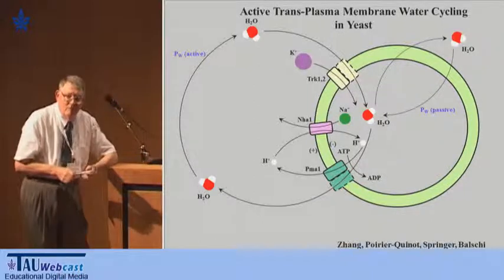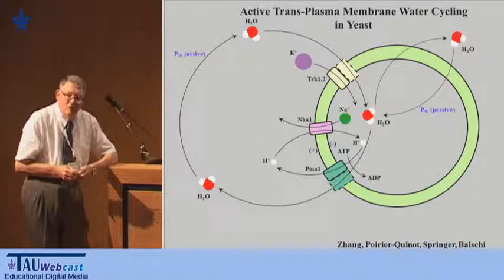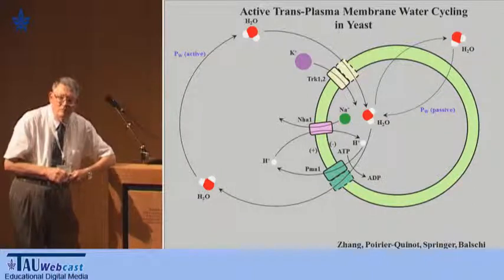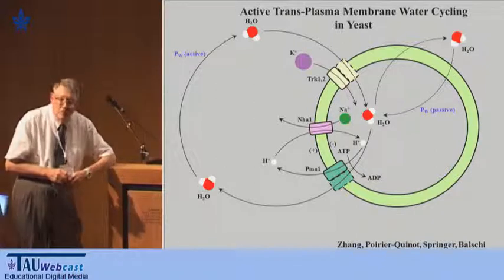Just a follow-up question. So in principle, of course, there are not enough protons, and then the net flux of the ions, the rate at which they go, can be relatively slow. But you could have an exchange that is going back and forth relatively fast, as opposed to the net. It is.